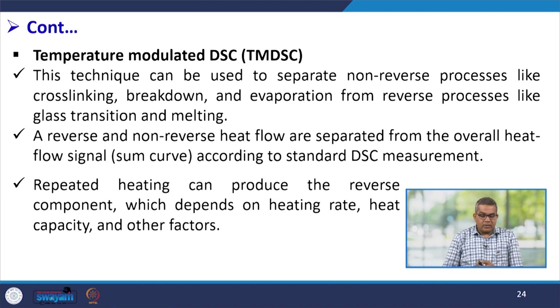Let's talk about the temperature modulated DSC, sometimes referred to as TMDSC. This technique can be used to separate the non-reversing processes like cross-linking, breakdown, and evaporation from reversing processes like glass transition and melting.